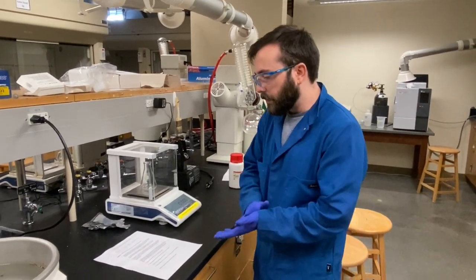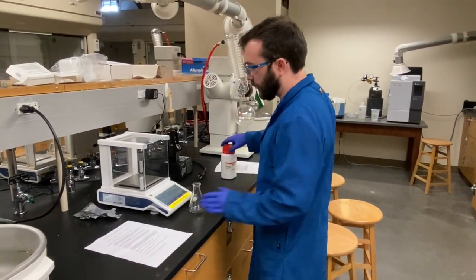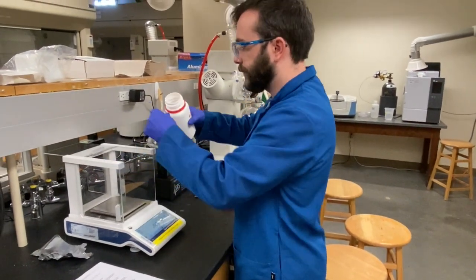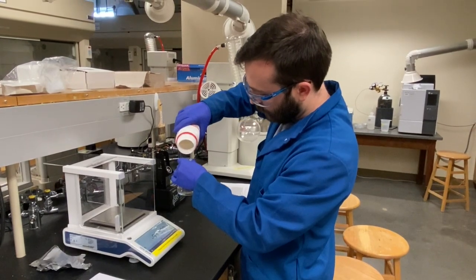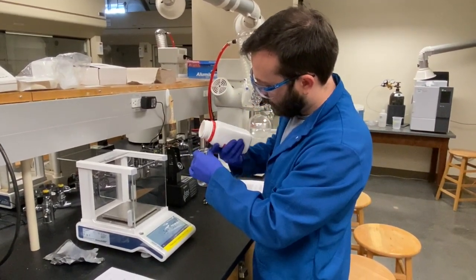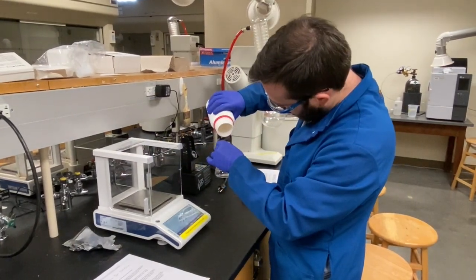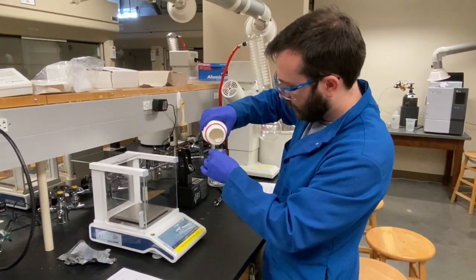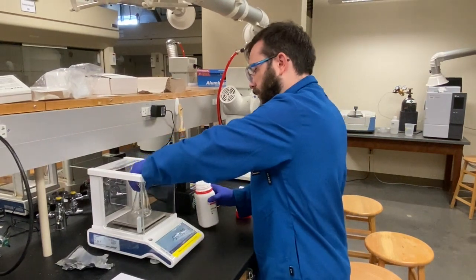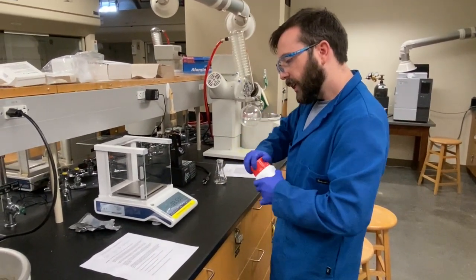To start the experiment, I'm going to weigh off 20 grams of polyphosphoric acid, which is a very viscous liquid, into this 125 mL Erlenmeyer flask. The flask has been tared to account for its weight. 20 grams has been weighed out, now 2.4 grams of benzoic acid.